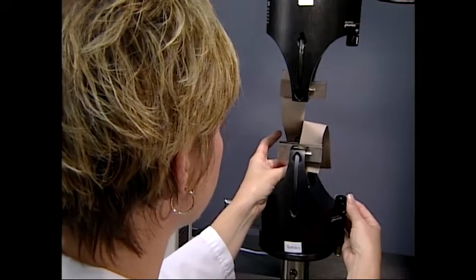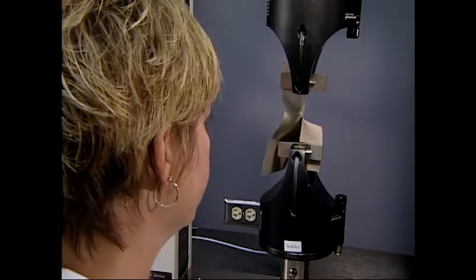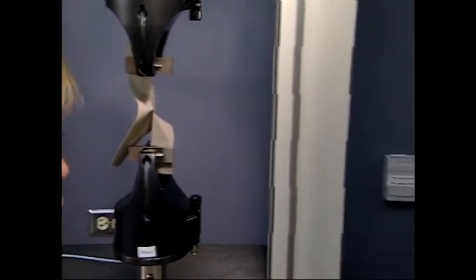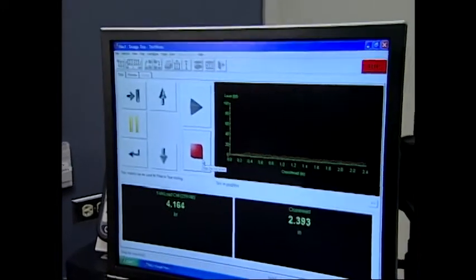The resultant force to continue the tear is collected and recorded. The tearing force is expressed in pounds force. As with the trapezoid test, the average of the 5 highest peaks is recorded. If fewer than 5 are experienced, the highest peak force is used.